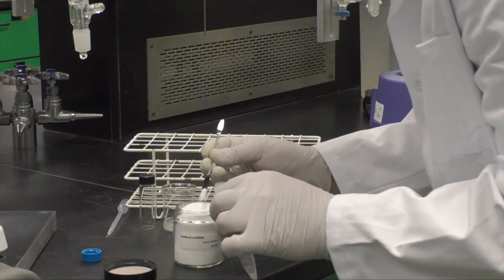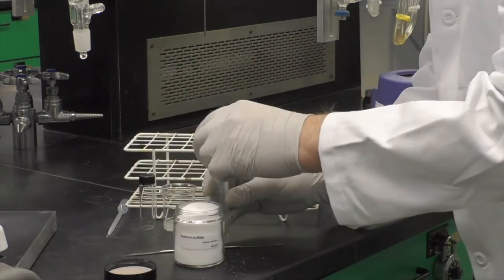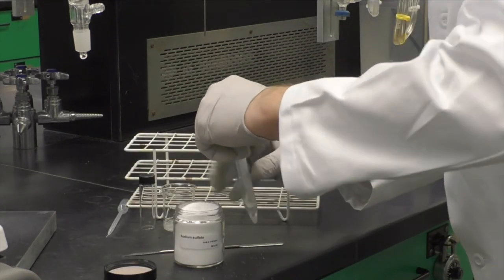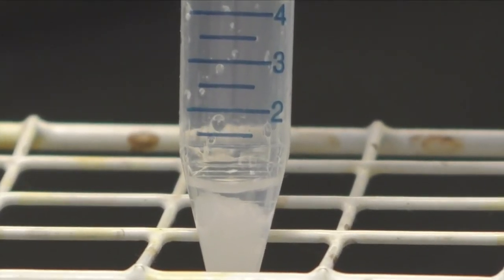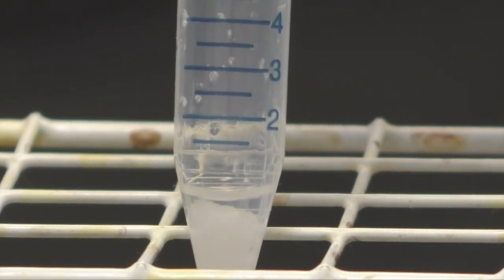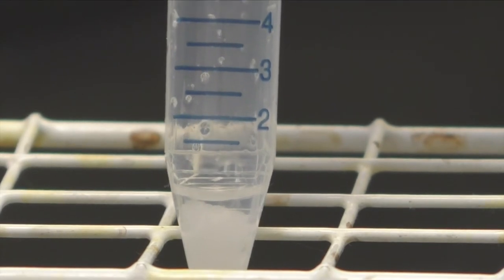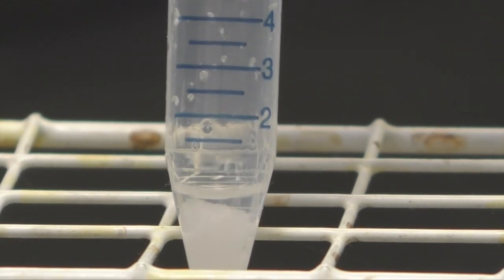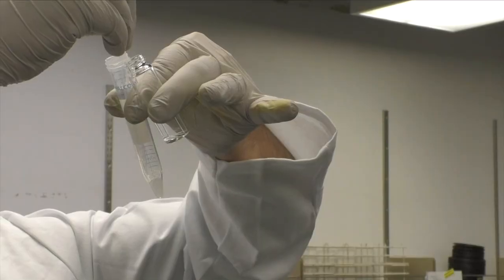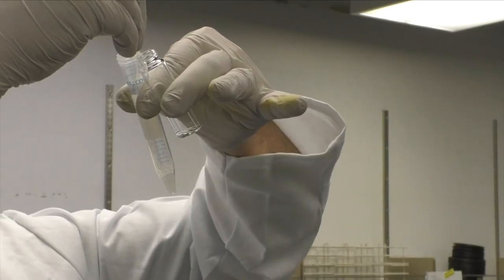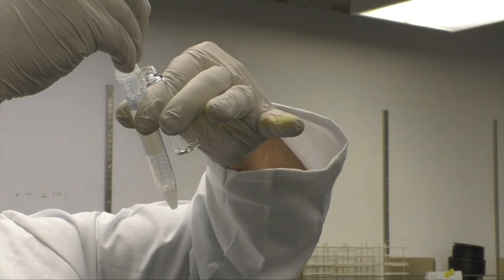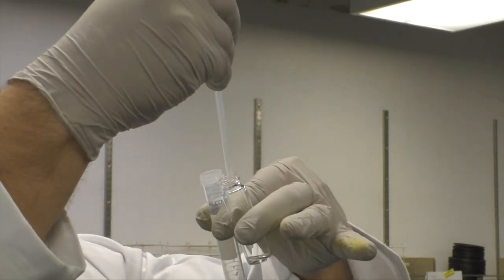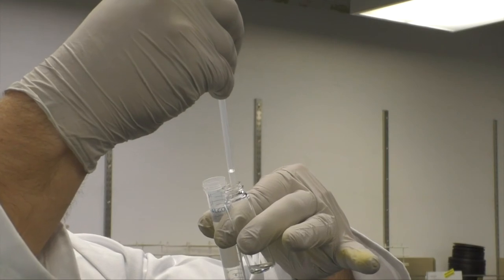To dry your product, add a micro spatula tip full of sodium sulfate to your centrifuge tube and give it a good shake. Continue to add the sodium sulfate a little at a time until the solid is obviously white and you can clearly see some granules at the top. Last, using a plastic transfer pipette, transfer the liquid, trying your best not to get any of the sodium sulfate, into a pre-weighed 4-dram vial.